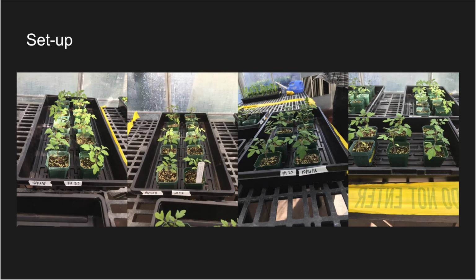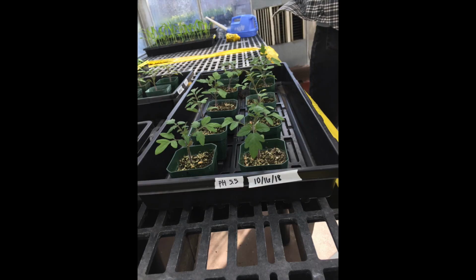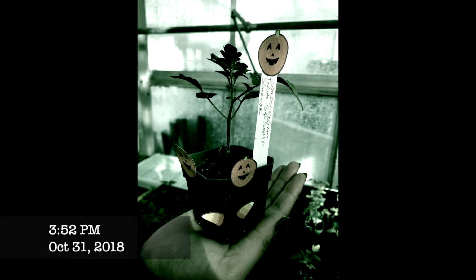To test this, we set up 4 different groups of tomato plants in a controlled setting in one of the greenhouses. We watered each individual group with different acidic solutions. We expected to see a decreasing trend in stomatoconductance, stomatodensity, and chlorophyll content from the control group to the 3.5 treatment group. We also expected to see smaller xylem conduit size and density correlated with increased acidity.